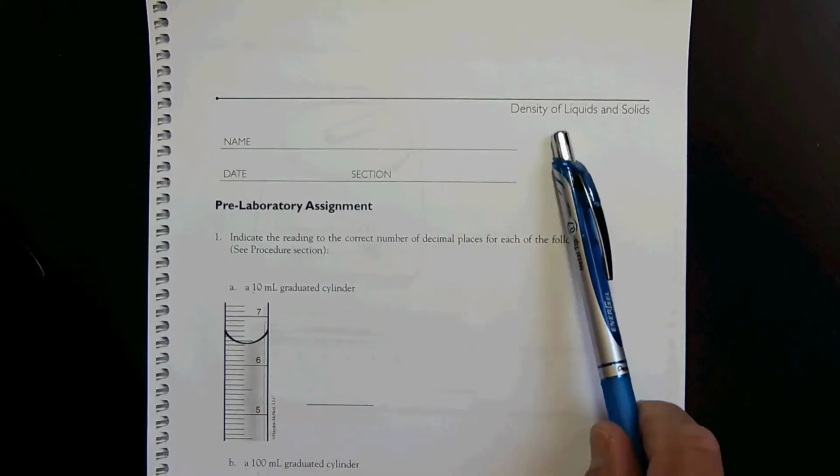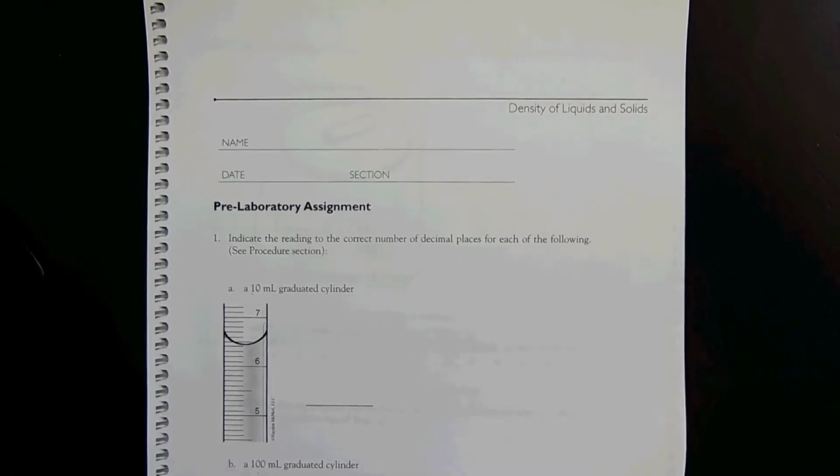Okay guys, this week's experiment is called Density of Liquids and Solids. You'll have to fill out a report sheet, quite a few pages from page 27 to page 36 here. Now, whoever put this experiment together on the Blackboard site, on the CNM Learn site, they made some modifications. So it's a little bit confusing.